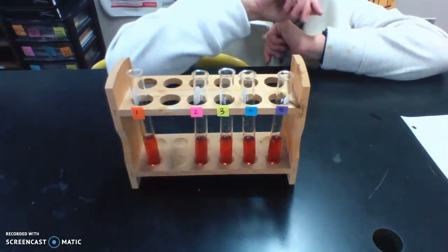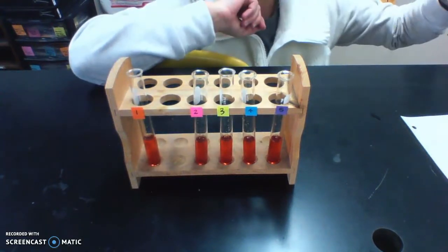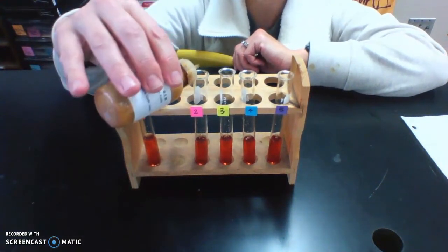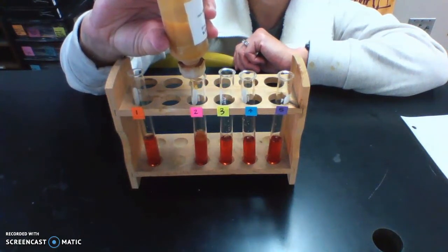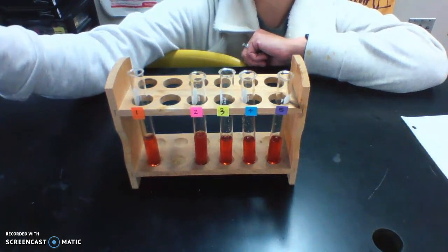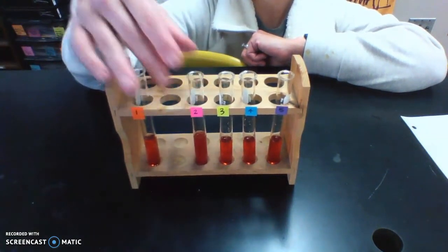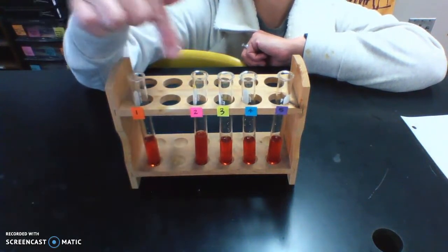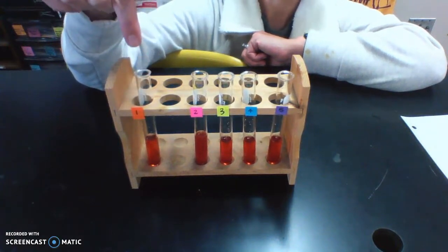So number 2, it says to add 20 drops of more iron(III) chloride to tube 2. So if I add more, so I increase my iron ion, you can see it really just kind of stays red. We get maybe what looks like precipitate because some of that iron(III) chloride has some cloudy solid, but very similar. So it looks like it stays this direction. It shifts the same way as this one.